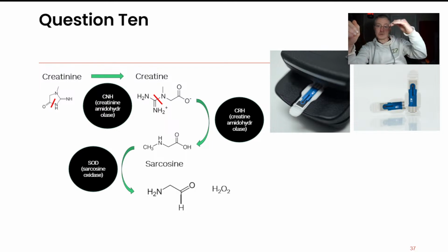So I give you super simple. Actually, creatinine itself is probably electrochemically active. You could do voltammetry on your buffer. You add in some creatinine, let's say 5 millimolar, and you'll probably see quite a nice peak develop. In fact, take a look at my caffeine work earlier on as an example of kind of, we showed decaf, we showed caffeinated coffee, and you'll see that there.